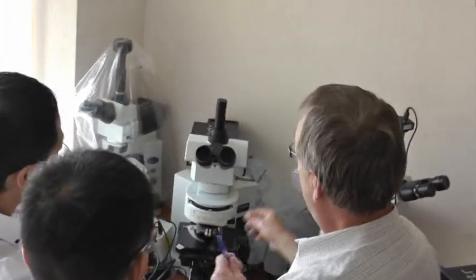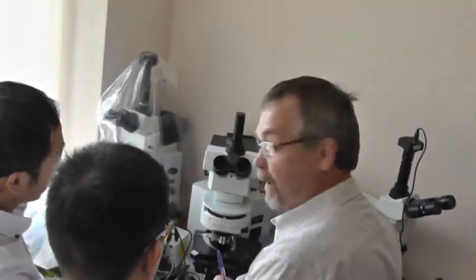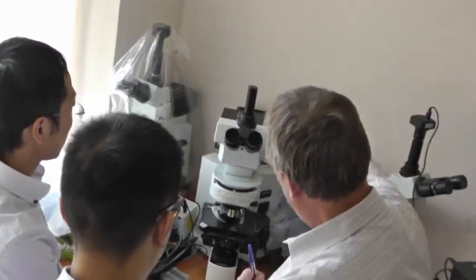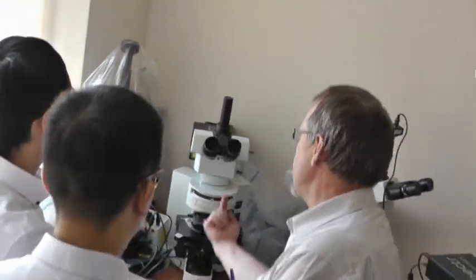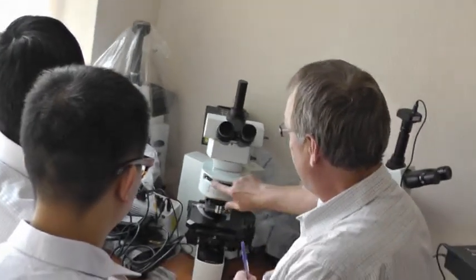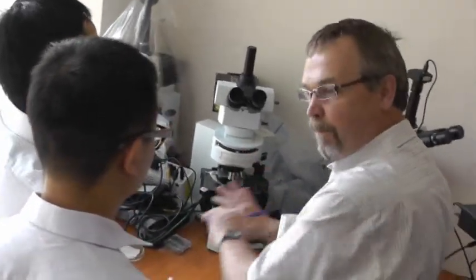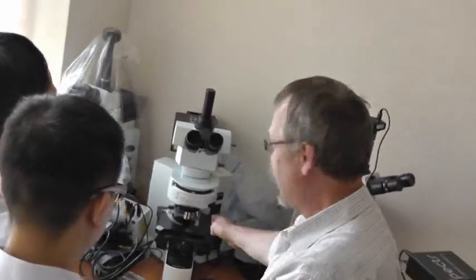Our device is here, then the cubic beam splitter. When you push the lever inside, it is inserted into the beam path, so the light from our laser passes through, comes to the objective, to the sample, and then the scattered light comes back. With the help of the same cubic beam splitter, it comes back to our spectrum analyzer. And by revolving this unit, we can avoid any glass part, any optics between our analyzer and the sample.